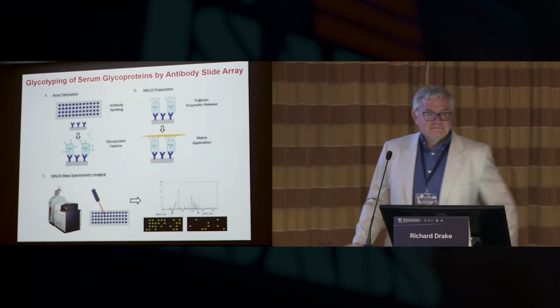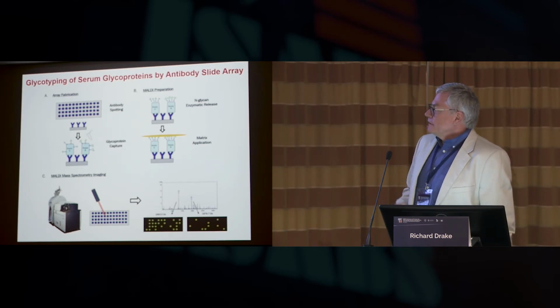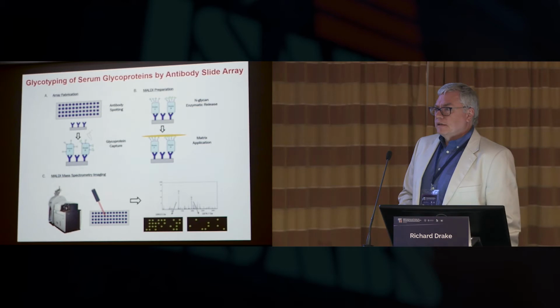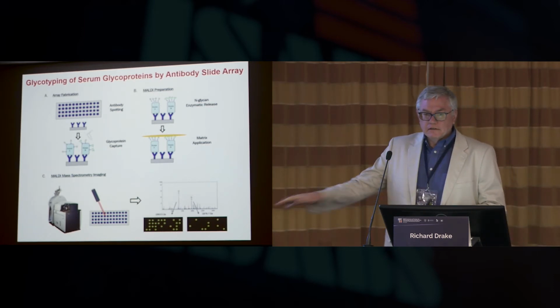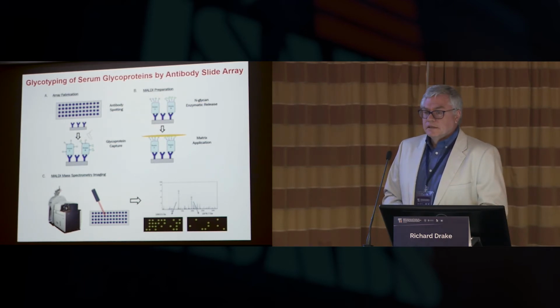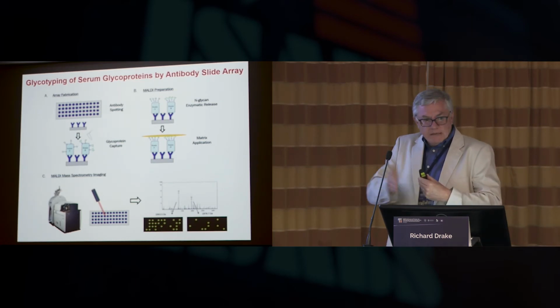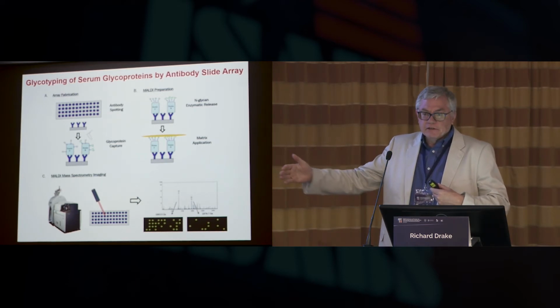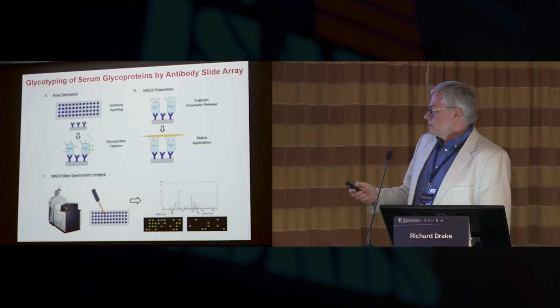Segue. So let me end with a few examples. Once we had nailed down the method, and this was very reproducible as far as the signal, with the PNGase we're using, essentially if we can get it onto whatever we're trying to digest, we're going to see signal. And it isn't like you get something that's unexpected. That's the beauty of the N-links. There are many variations, but there's only so many ways you're going to see in the mass spec, particularly in the lower mass ranges.